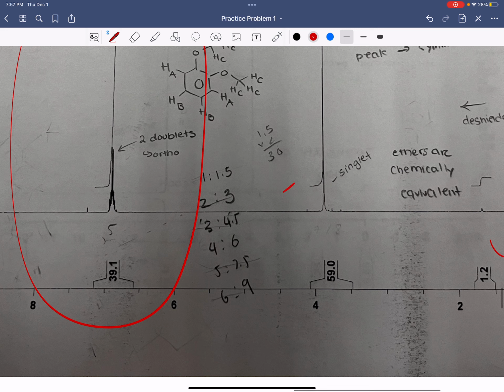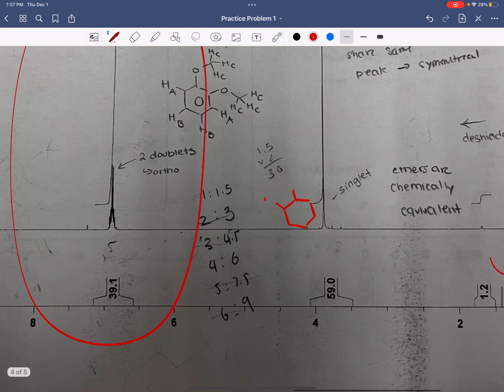For example, when there are 2 hydrogens present and the rest are side chains, the chance of having 3 side chains with only 3 hydrogens in total is low, because there would have to be other groups, like halogens, that don't have a lot of hydrogens, which is almost impossible.